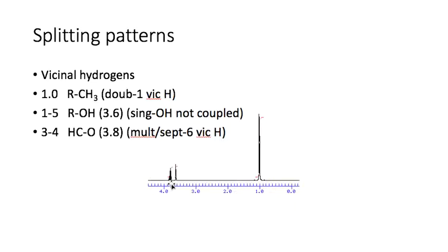And this one here, what a little mess we have over there. A multiplet, not a quartet, a mess. And at a higher resolution, that little blobby thing actually has 7 peaks, if you zoomed in on it really, really closely. And the reason it has 7 peaks is because it's next to 6 things, 6 hydrogens. So this one would be next to 6 hydrogens. They could all be up. They could all be down. 5 of them could be up, and 1 of them could be down. You see how this could possibly work out?